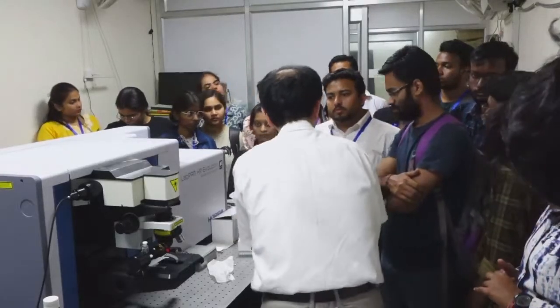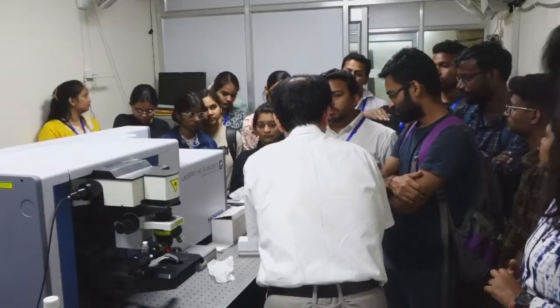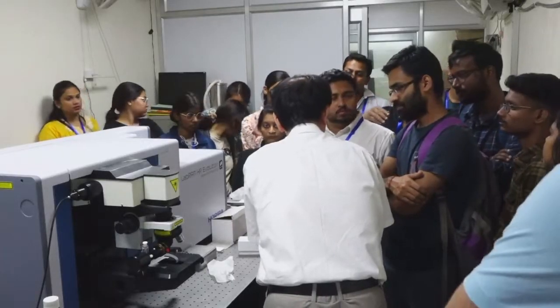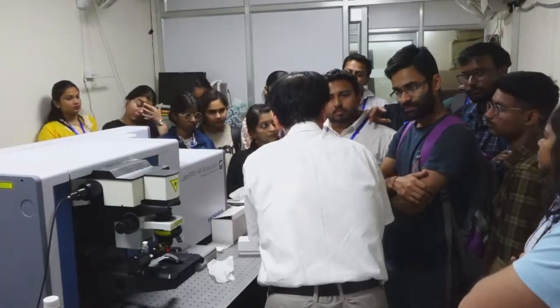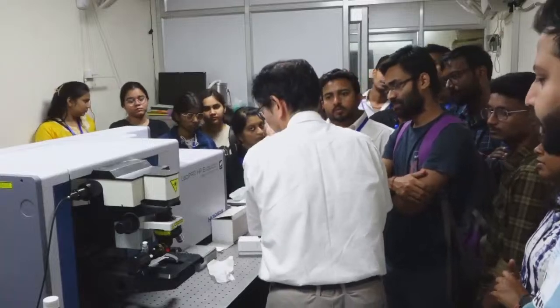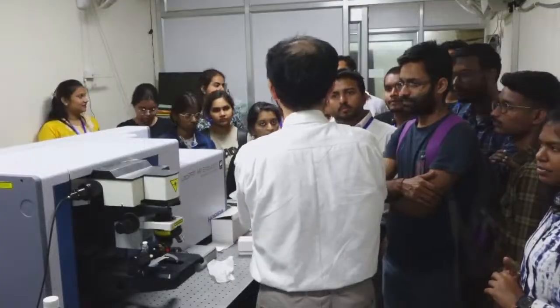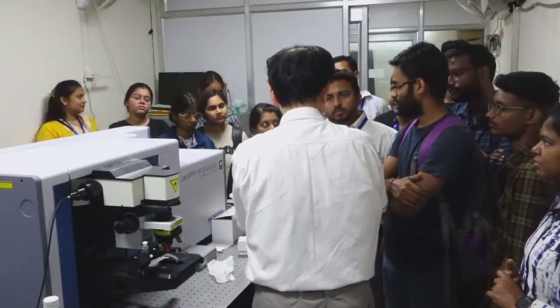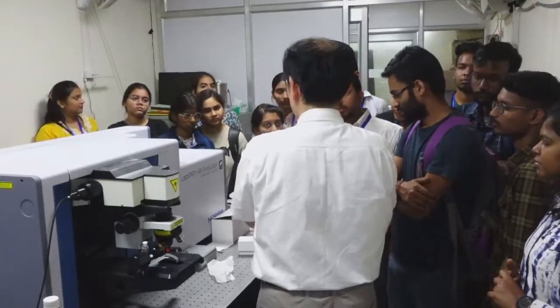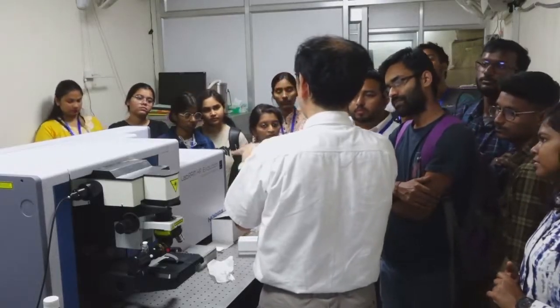Like we used to do in the UV spectrophotometer, we have to set a baseline correction. Do we need to do it here again? Baseline correction, as necessary. There are many reasons that affect the baseline.